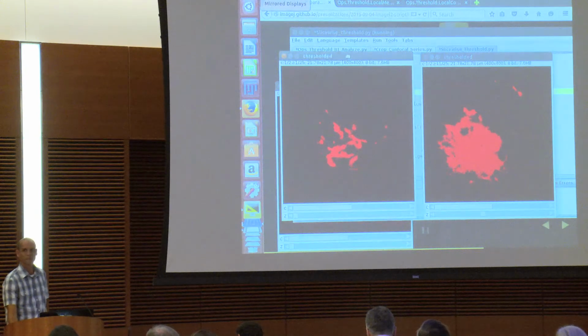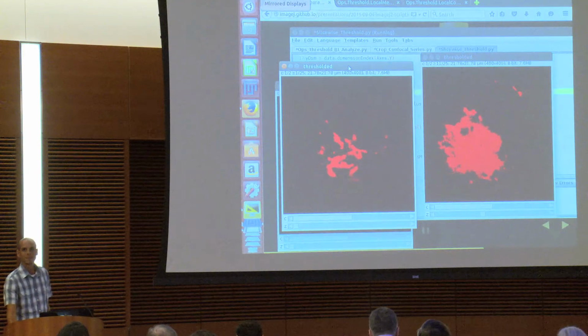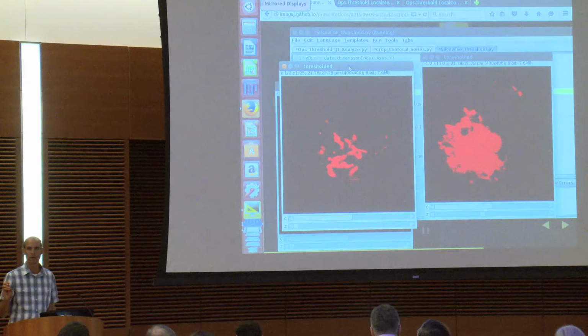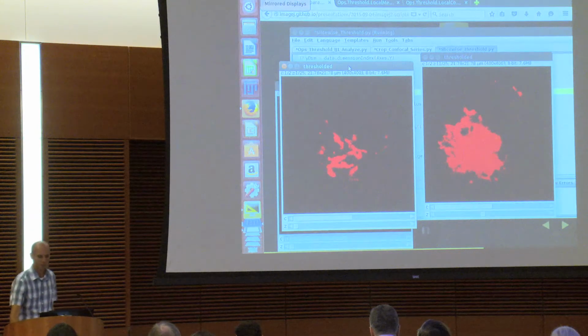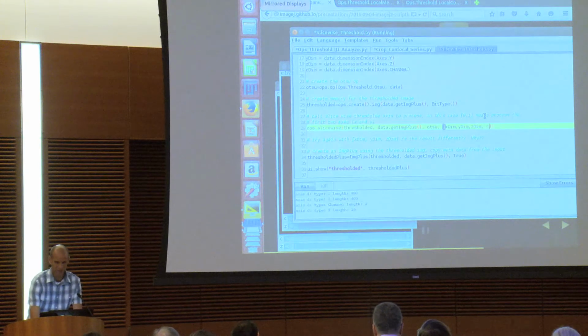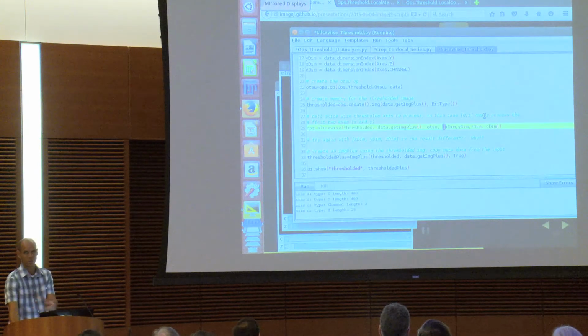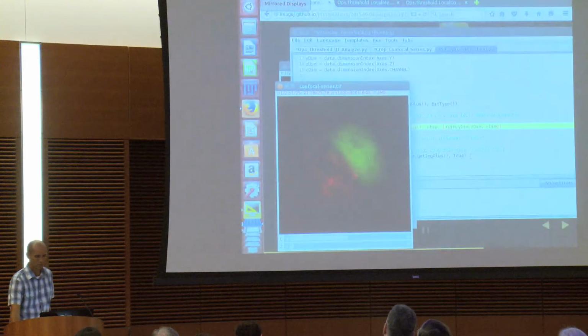Yeah, I think that's exactly what we did here. When I passed X and Y, it said use each slice. When I passed X, Y, Z, it was like each volume, and then you could actually pass C. The result might not make sense, but this time it's going to use the entire data set.